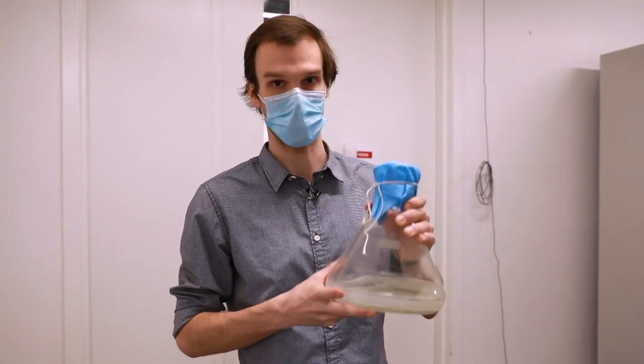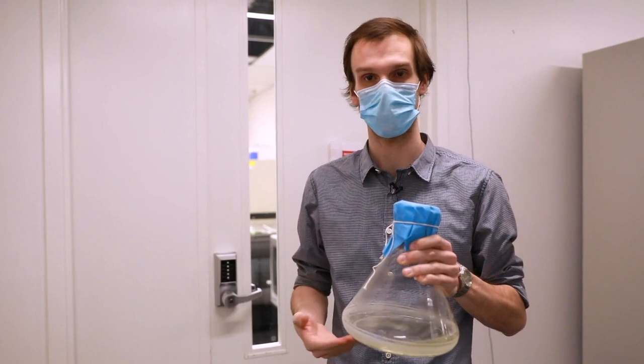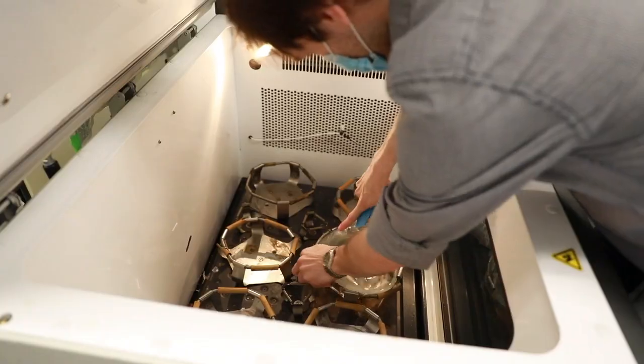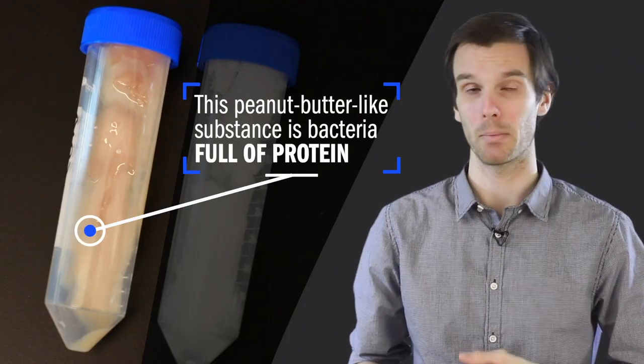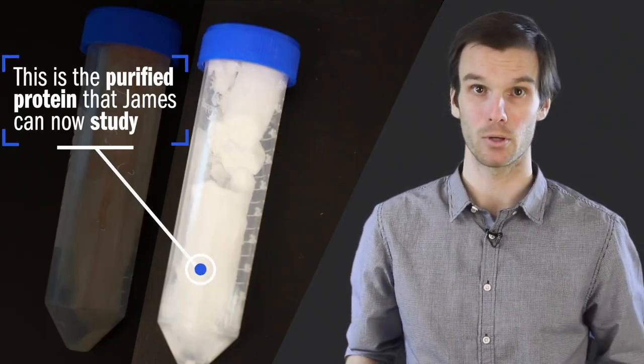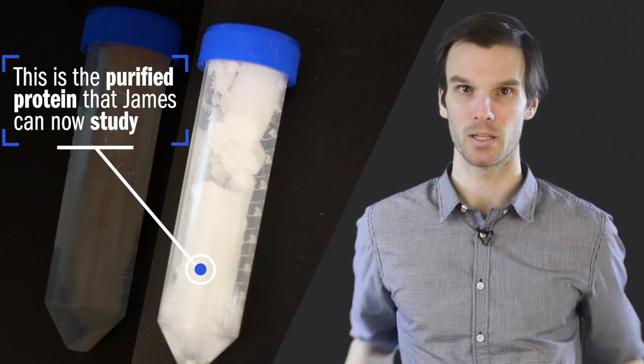This is a flask of bacteria food. We are in front of the shaker room, which is where we grow bacteria and where bacteria make protein. Shake, shake, shake. Shake and bake. Then we separate the protein from the bacteria. We purify the protein. And once we have this purified protein, let the experiments begin.